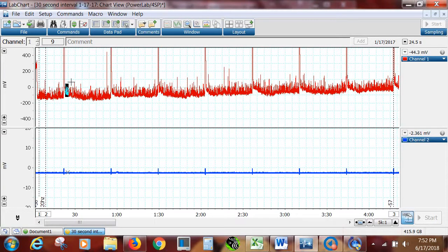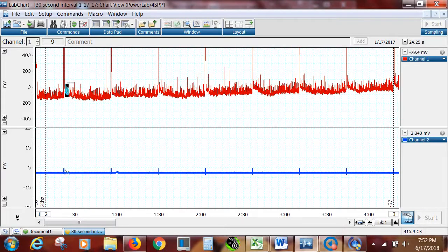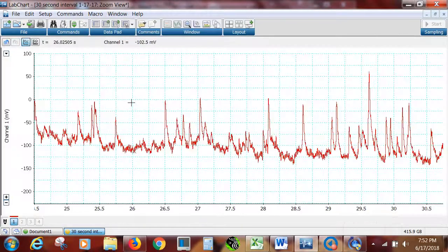So we want it right like on 24.5. And then we can take another bar or so. Okay, like that. Okay, and then hit zoom. And we already went to 25.5. So let's go 25.5 to 26.